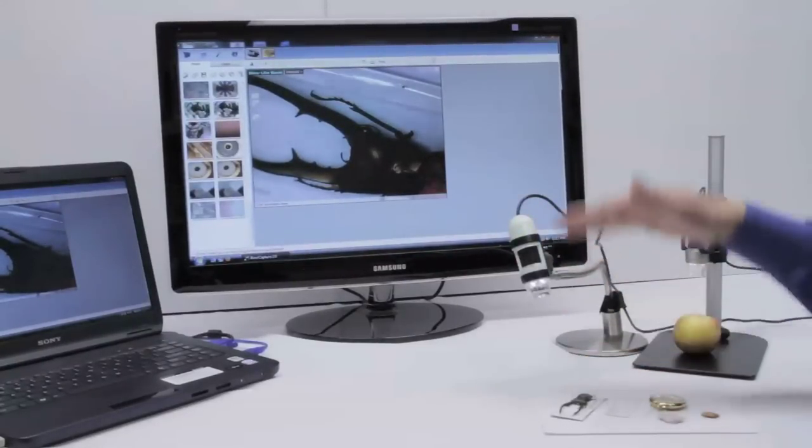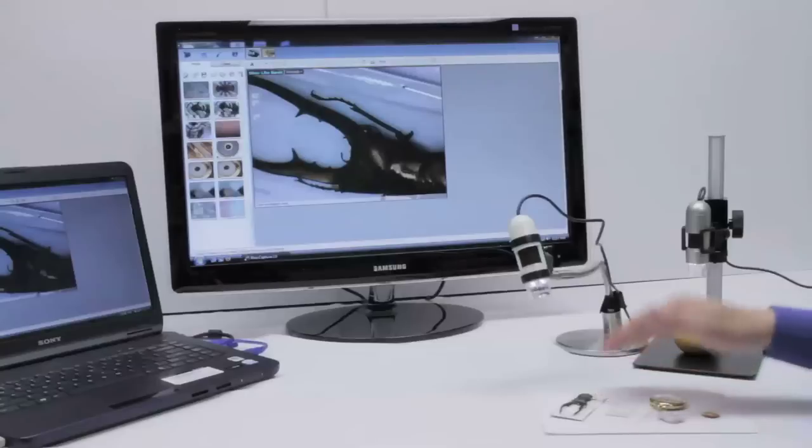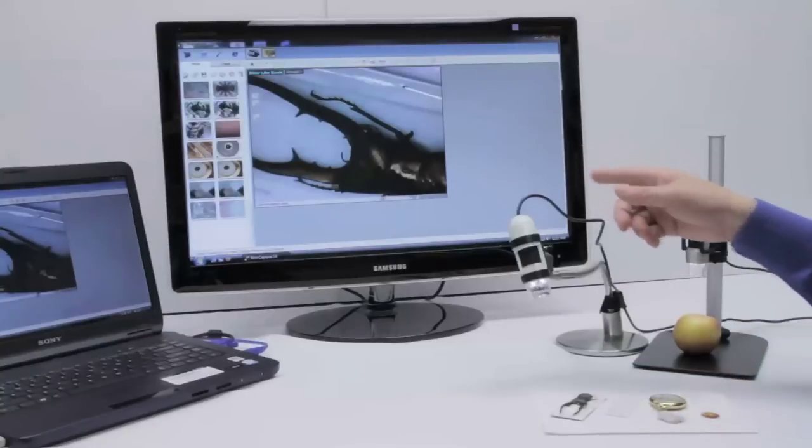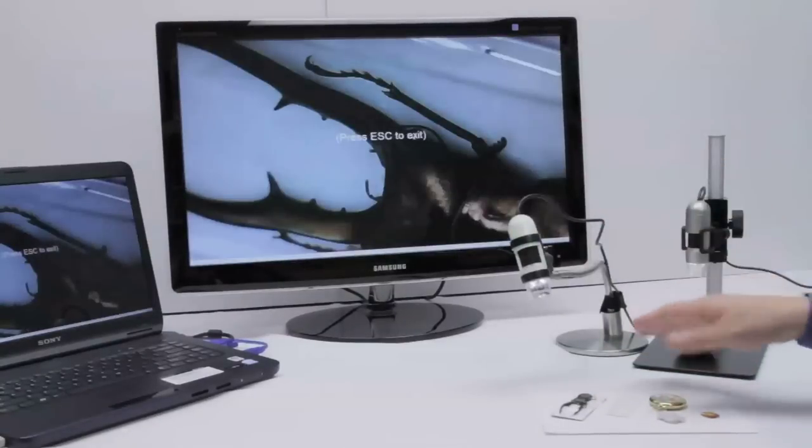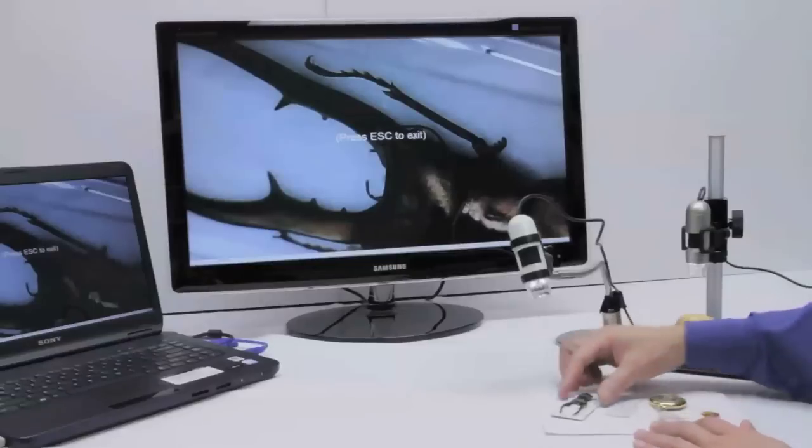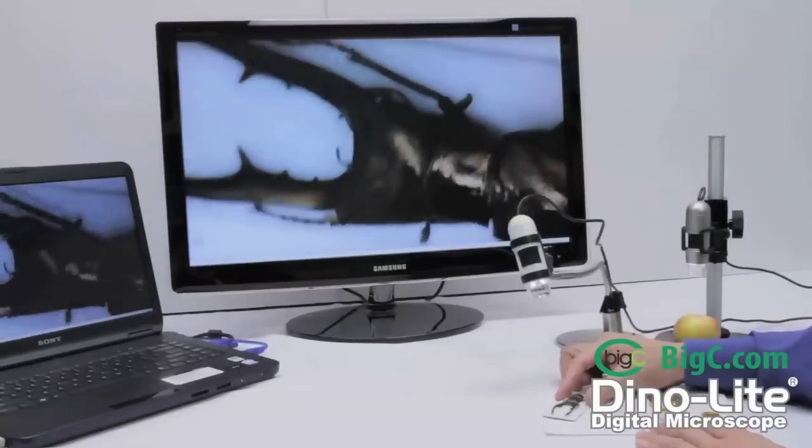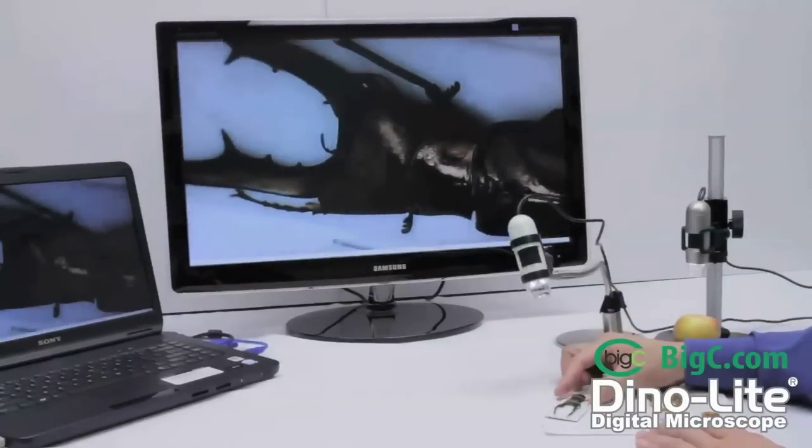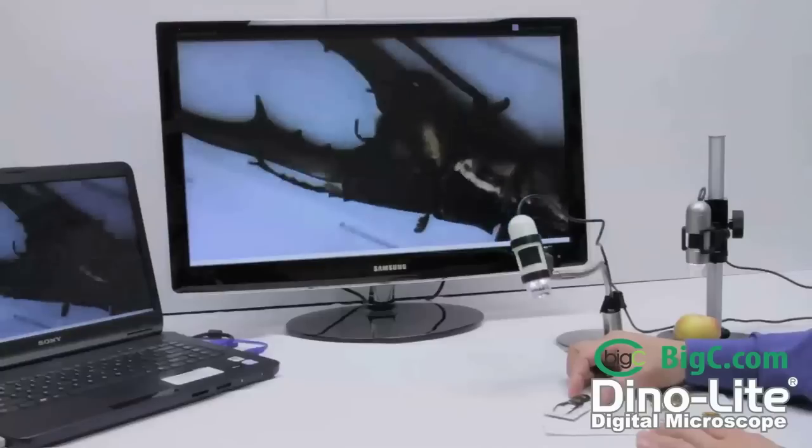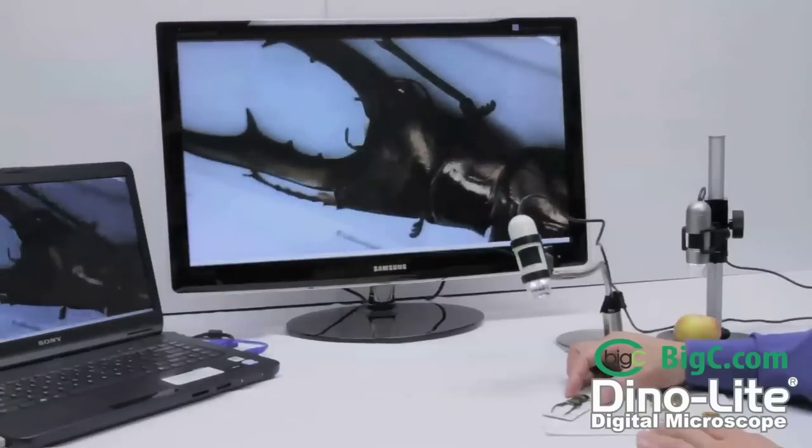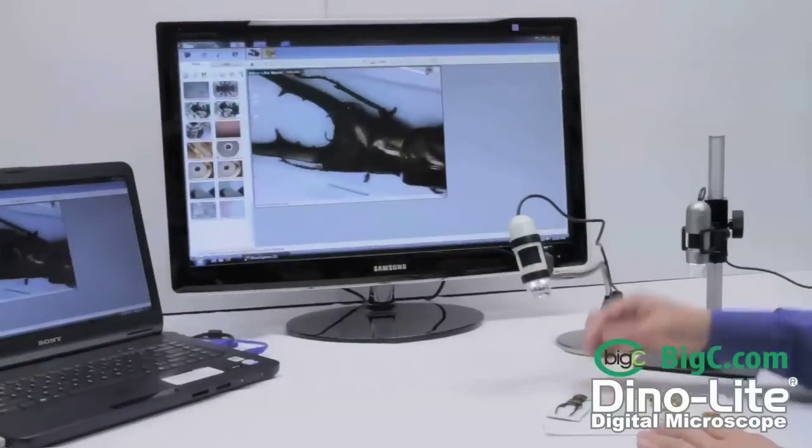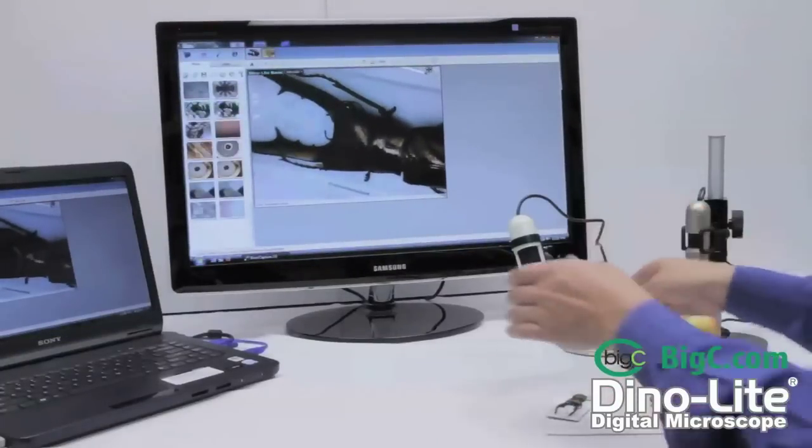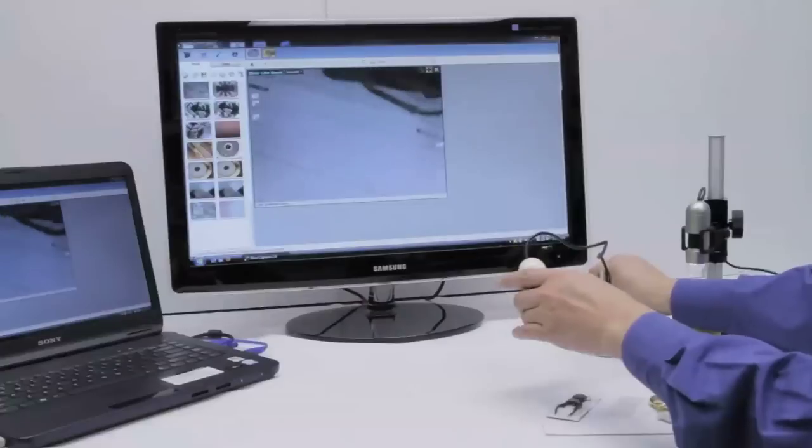This scope works well far away from or up close to just about any object. The AM2011 can display in full-screen mode as seen here. This can be helpful during classroom presentations and a helpful visual aid during lectures as well.